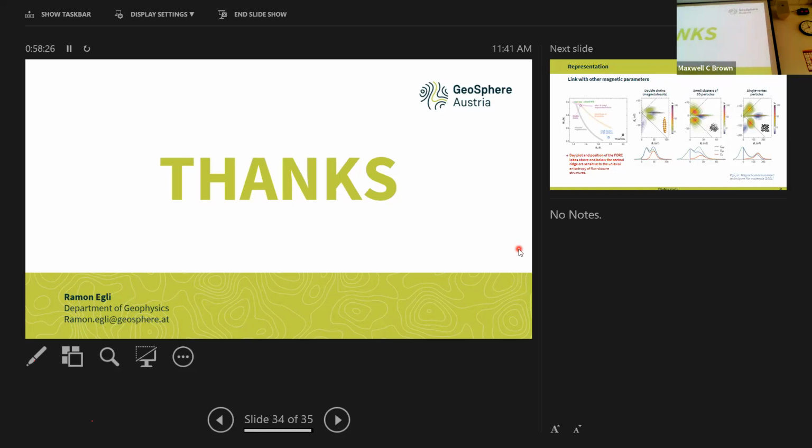Yes, and this is because the FORC function works as a high-pass filter. So basically, you select quick or rapid magnetization changes. If you have your temperature changing slowly, let's say between the beginning of your measurements and the end, there is a continuous drift. You're just changing a little bit, for instance, the magnetic properties of the sample.